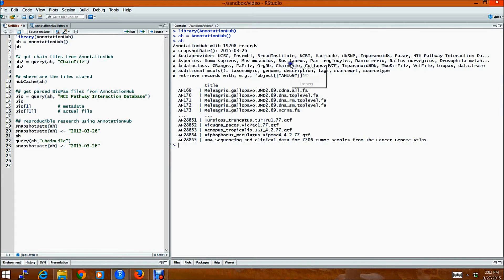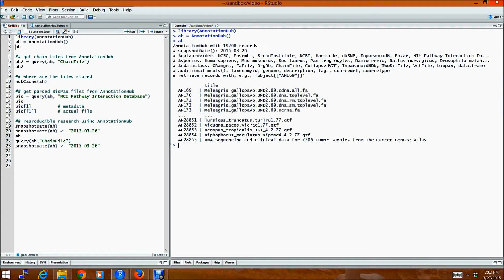Or if the data is too big because of memory constraints, we return back the file object to you. And you can see that the title for a few of these records are already displayed.